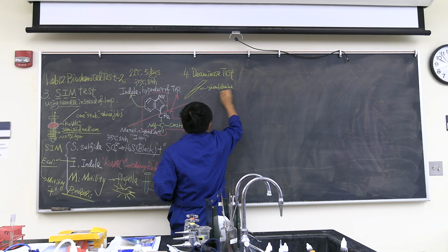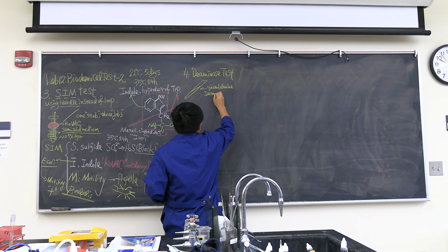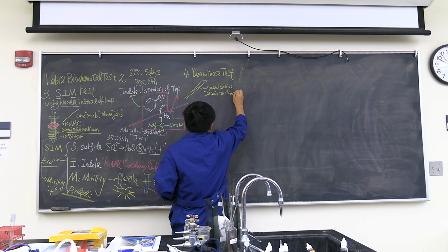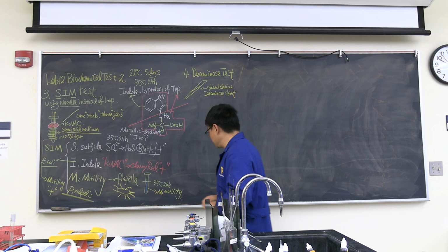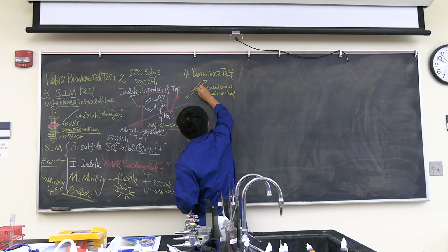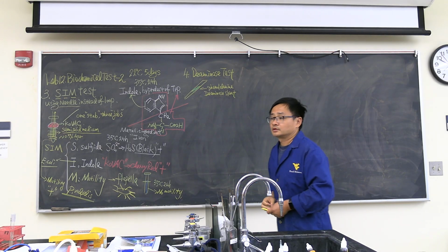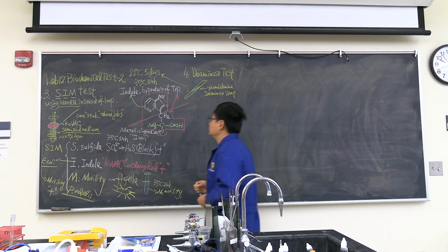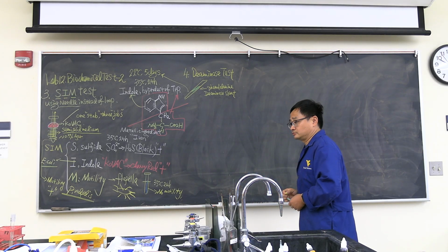And then we're going to incubate 22 degrees Celsius for 5 days.